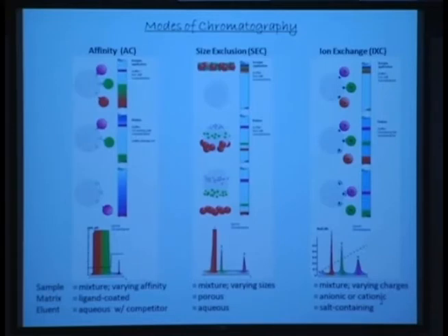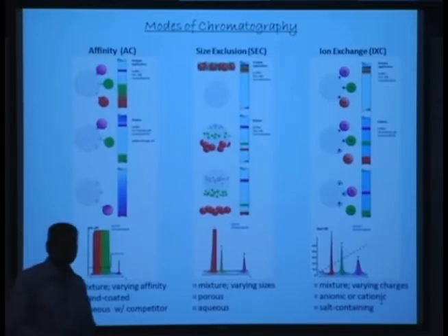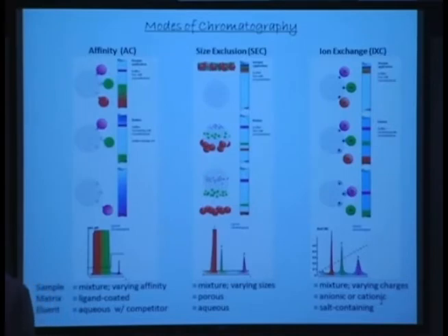How does the shape of the molecules affect the elution time? Like, for example, especially for the polymers, some have a linear chain and some have branches. So could this method separate those polymers that have different shapes? Absolutely. Yeah. It's not just the molecular weight. It's not obviously just the hydrodynamic volume, but also the shape.